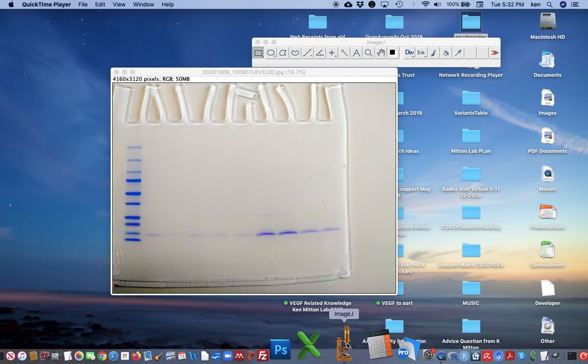Look up ImageJ. It's basically evolved from what used to be called NIH Image, and it was at that time written for different codes and different platforms, and then once it got programmed into Java, it's usable on a lot of different systems now. ImageJ.